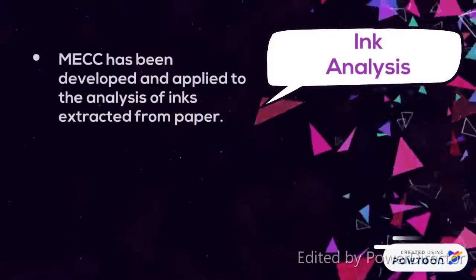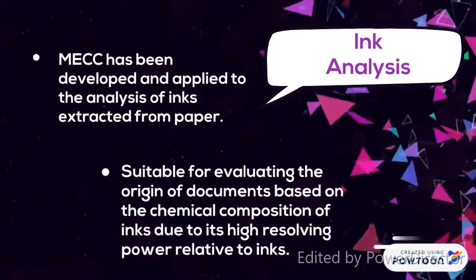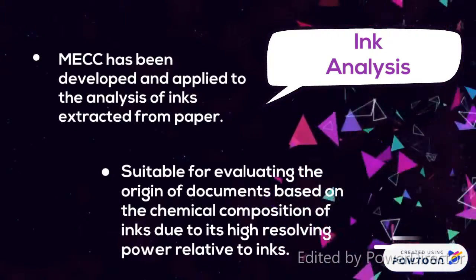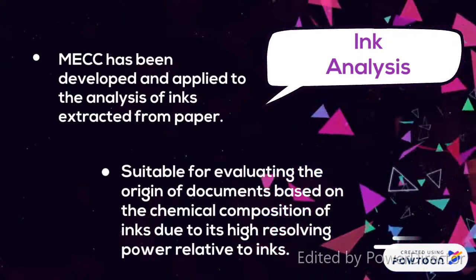Ink analysis. MECC has been developed and applied to the analysis of inks extracted from paper, suitable for evaluating the origin of document based on the chemical composition of inks due to its high resolving power relative to inks.